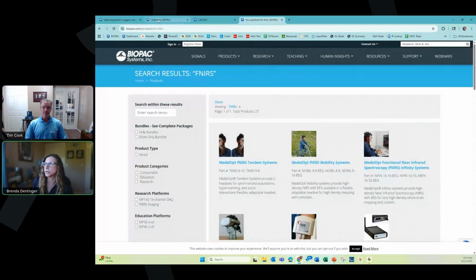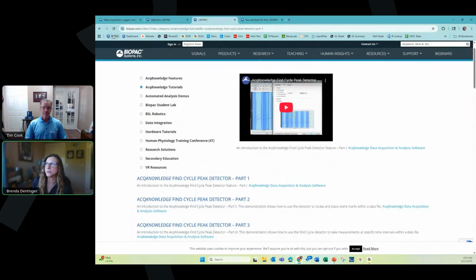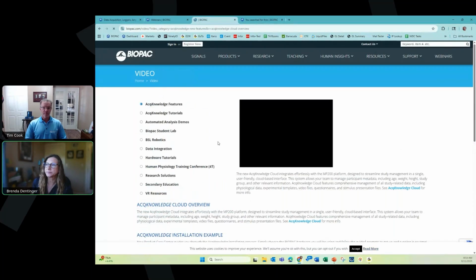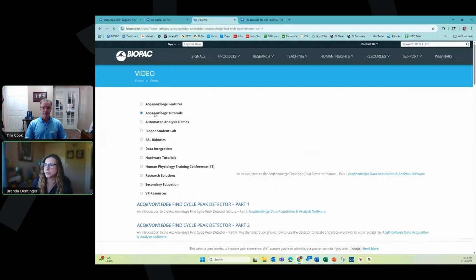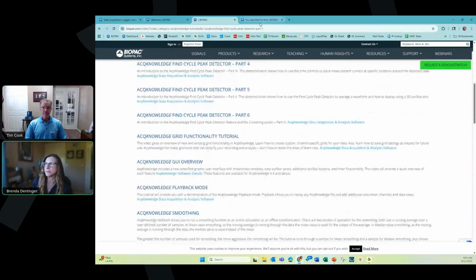In fact, since you were talking about the cycle detector, if you go to our support section, you can go to video tutorials here. And then if you click AcqKnowledge, it'll teach you about the peak detector here. There's lots of great videos and training information on our website.